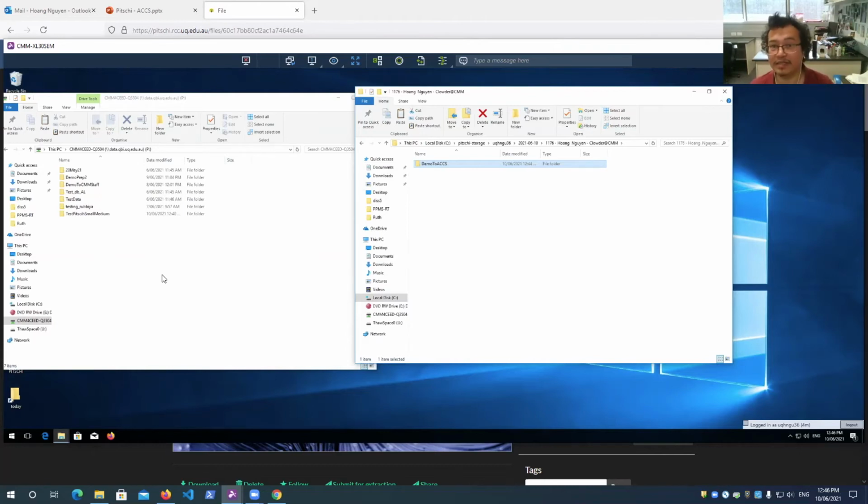But in case the user forgets, they still get charged for occupying the machine, so it's not a big problem. The bigger problem is things like a power outage or anything that happens out of user control, and there's still something in that X API that checks that case.